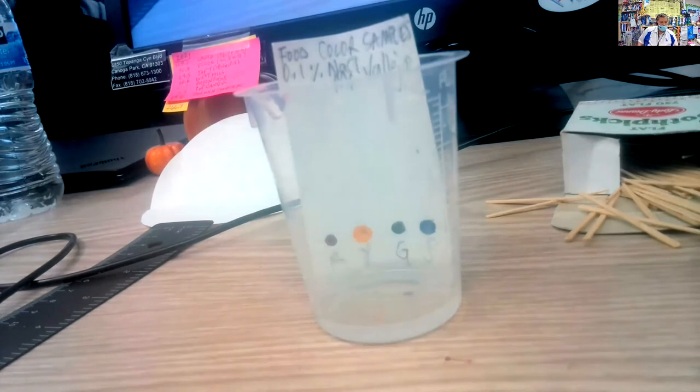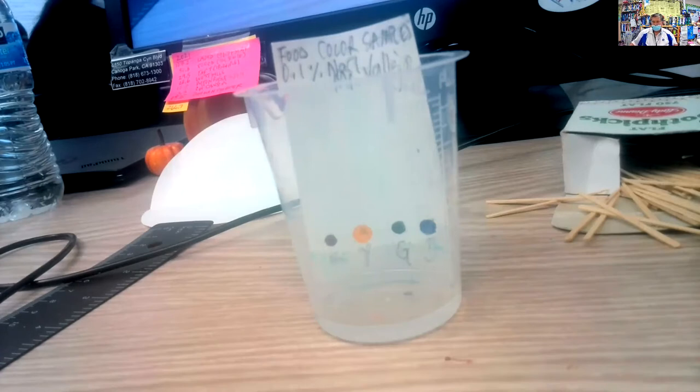Okay. And so now I've got the solution coming up. What's going to happen is the salt water is going to come up to the paper. And as the salt water comes up the paper, it's going to separate the chemicals that make up the food coloring. Okay. So we're going to go ahead and let that run and let you watch that. But I'm going to mute myself so you can concentrate on watching the colors separate.